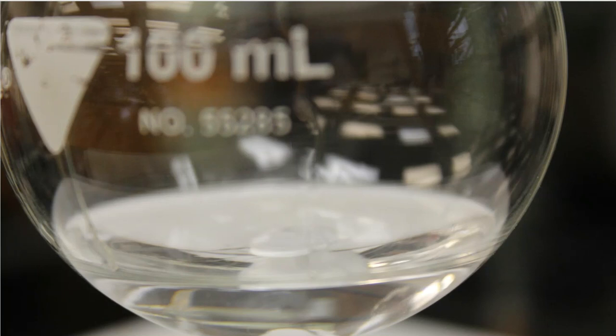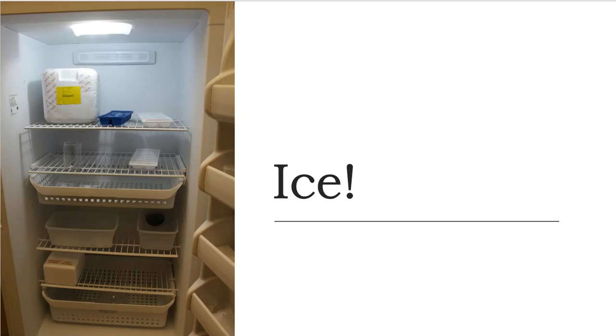Again, you can make observations if that's what you need to do. The lab directions also say something about an ice bath. All right, so I go to my freezer in our prep room area. I get some ice out. Notice that I've already put a beaker in here. I've got it cold. So that way when I do put my ice in and I put the water in, it doesn't kind of shock it and my water gets super warm all at once.